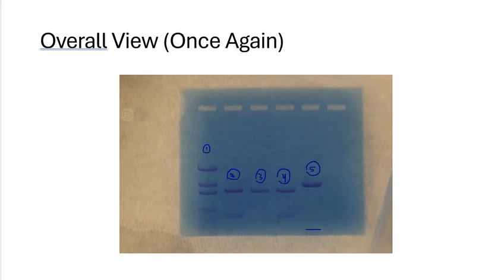So the goal of this lab experiment is to determine if either of these suspects were present at the crime scene. So unlike a paternity test, if we want to know if they were present, then that means that their banding should show up, and it should be a perfect match, right? The parental DNA lab exercise made you match half and half.